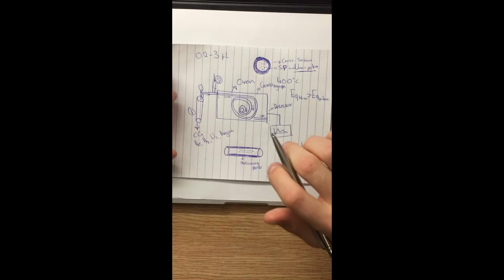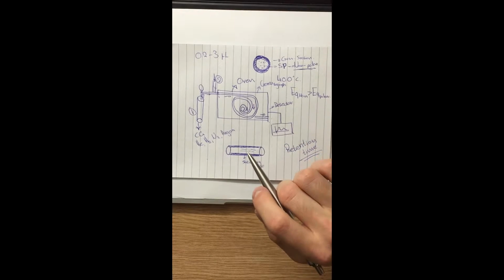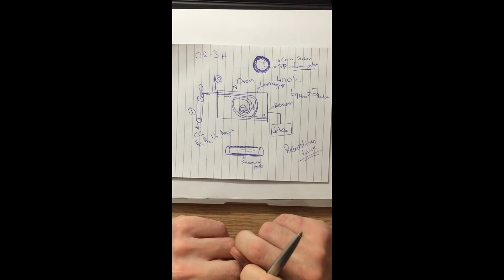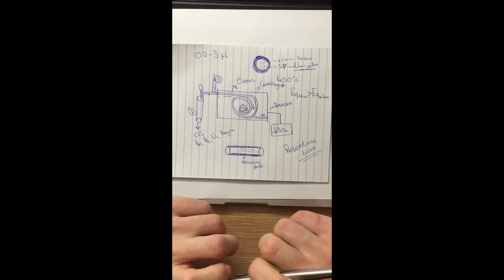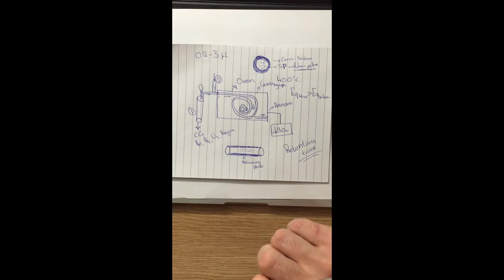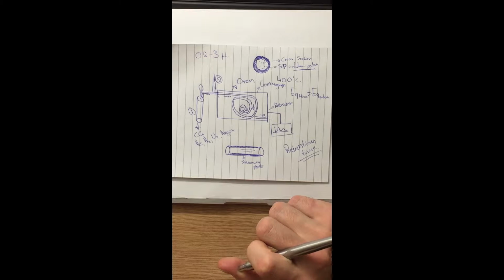Chromatography is a very useful technique for engineers, but mostly for chemical engineers and biochemical engineers. For chemical engineers, chromatography helps them find out more information about the gases in a gaseous environment. For biochemical engineers, chromatography is essential for protein synthesis and protein investigation. Today I'm going to talk about gas chromatography.